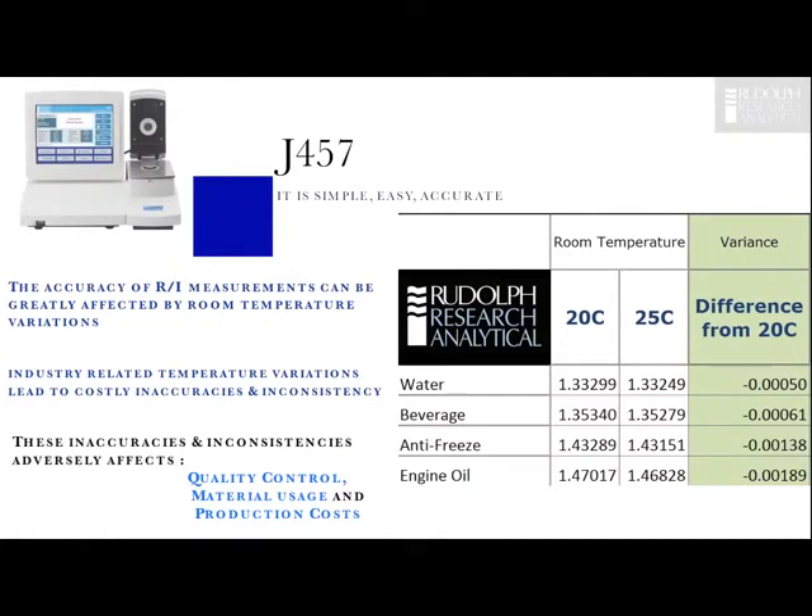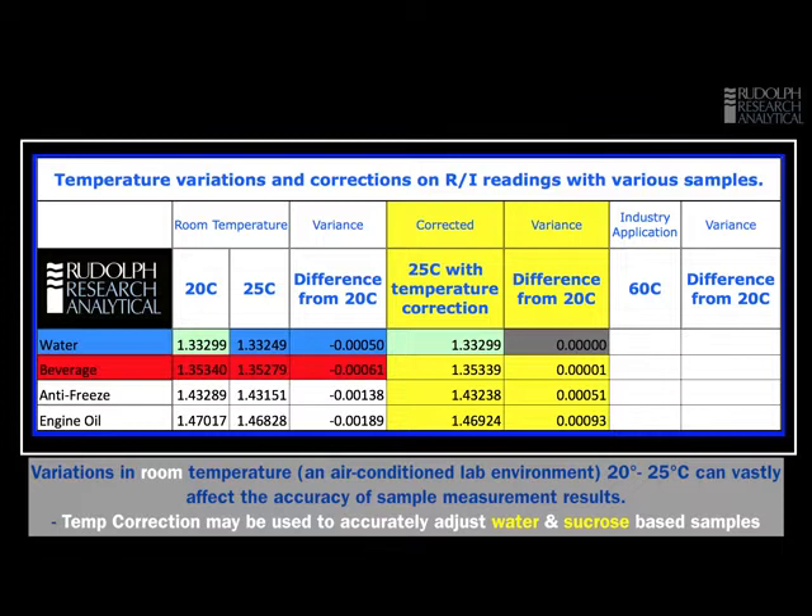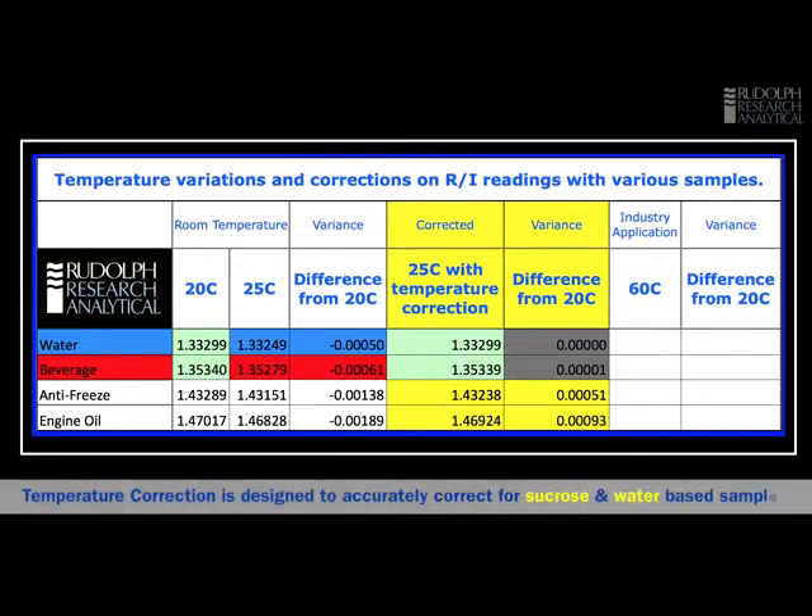As you can see the difference is quite significant. For many samples we have errors well into the third decimal place. With water we got a number at 20 degrees, a very different number at 25, with an error of about five in the fourth decimal place. When we switched on temperature correction we got the same result as at 20 degrees, which proves that with a water sample temperature correction works well. We also tried cranberry juice — once again a big variation from 20 to 25 degrees — but with temperature correction switched on and the sample temperature stable, the temperature correction removed the error. This is not surprising because cranberry juice is mostly sugar, and this is what temperature correction is designed to work with.